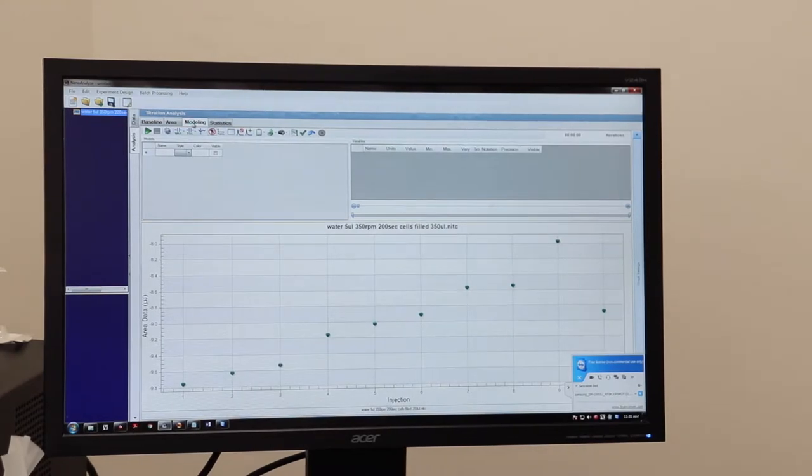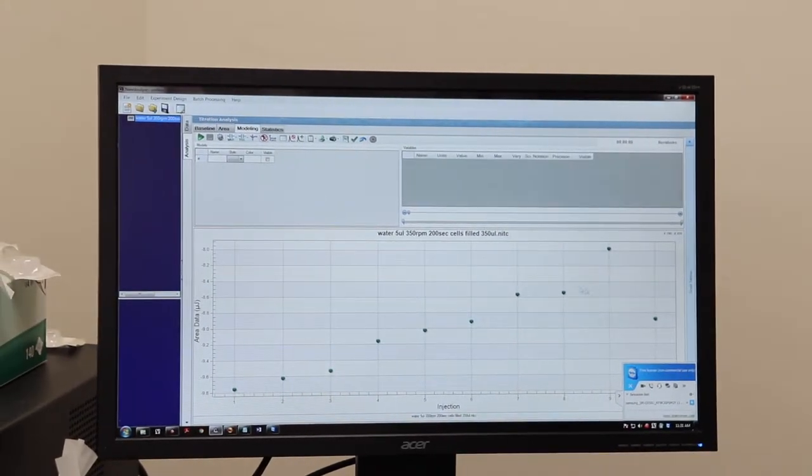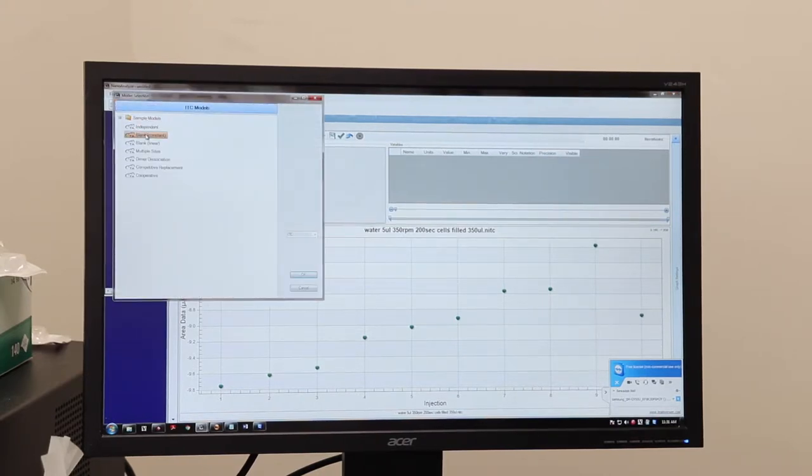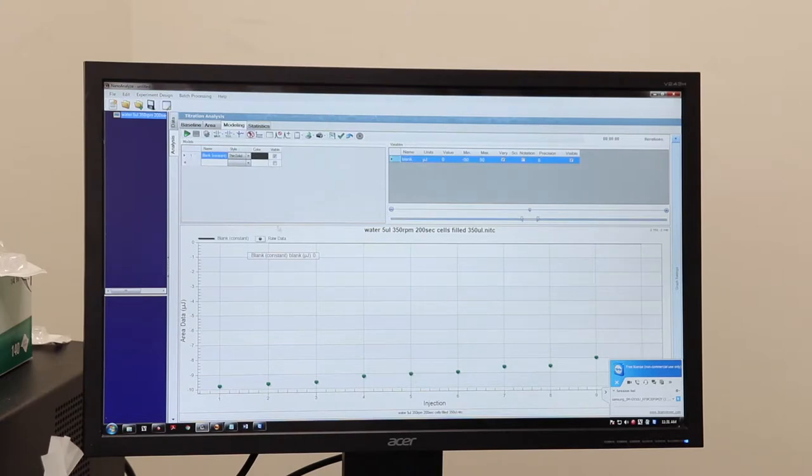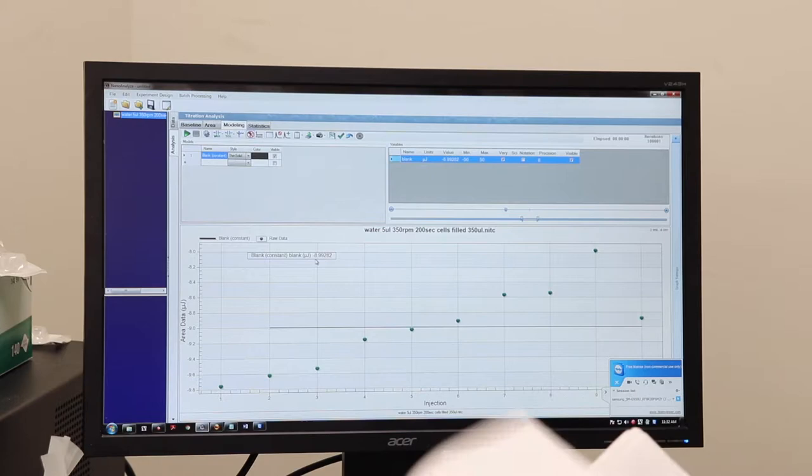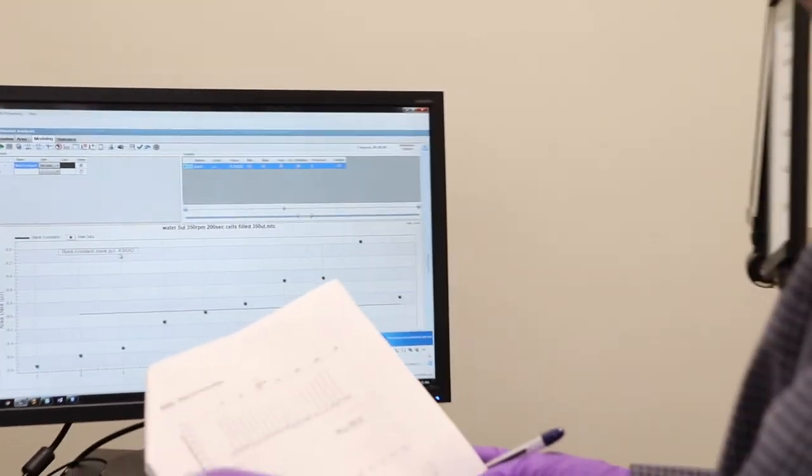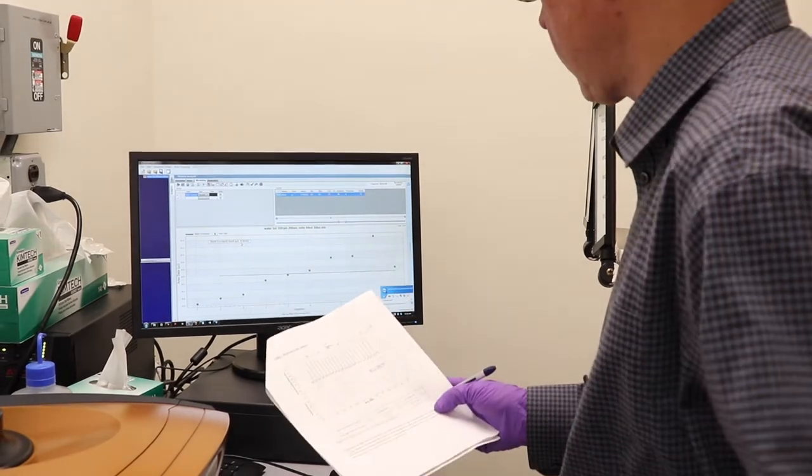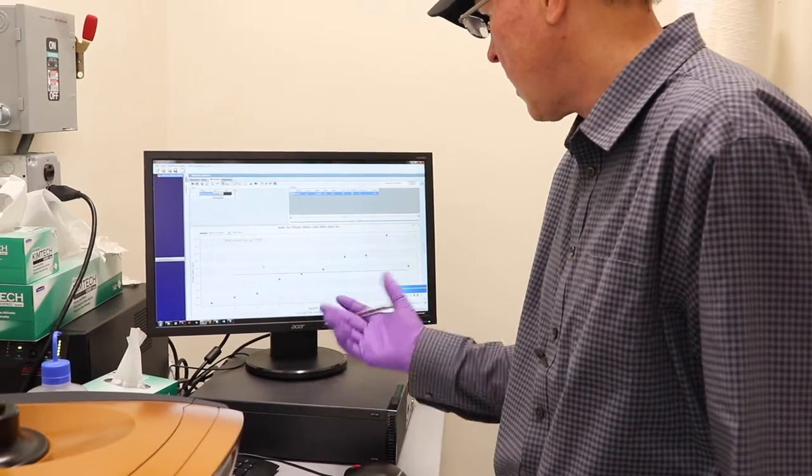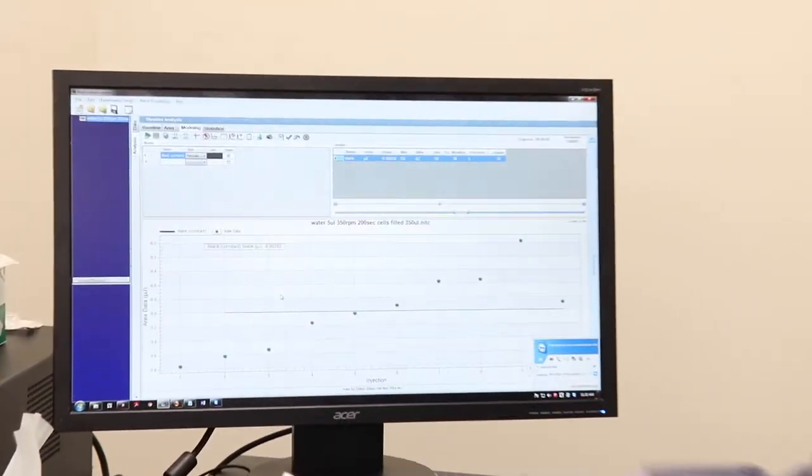So when you add more than 182, that'll fill up the actual chamber. The rest will simply be above the stirring bar and the titrant that's injected into the bottom. And the 182 is measured at the factory before they send it out. So that's what you want to use. So you'll make sure these are correct. Then we'll go into the modeling tab. We can see our points here for the water one. Simply add a blank one. Okay. And then allow it to fit. It's basically fitting just a flat line. And it's giving us an average of about minus nine microjoules. According to the test kit, the appropriate value is minus three, plus or minus two. I've never seen it that low. In fact, this is when they installed it. So around minus 10 or so is probably fine.